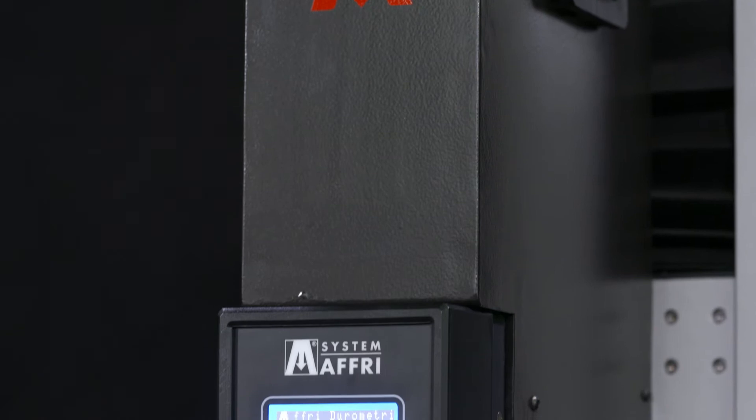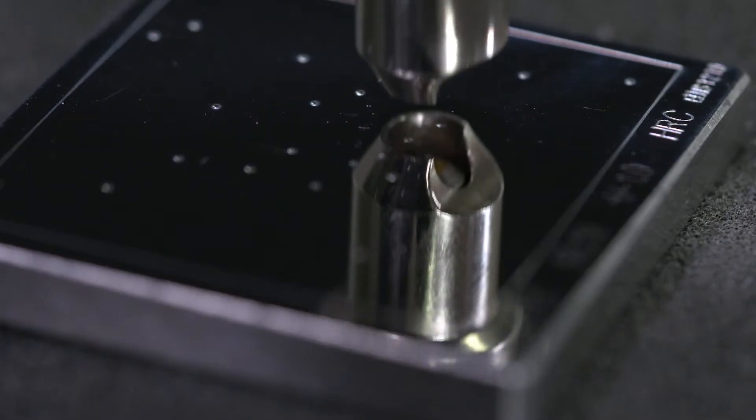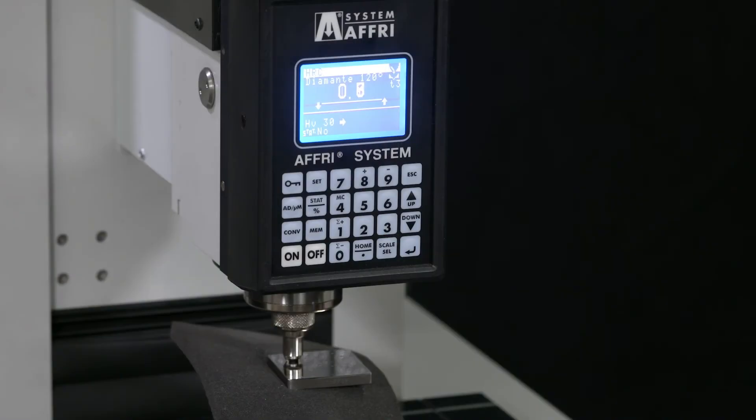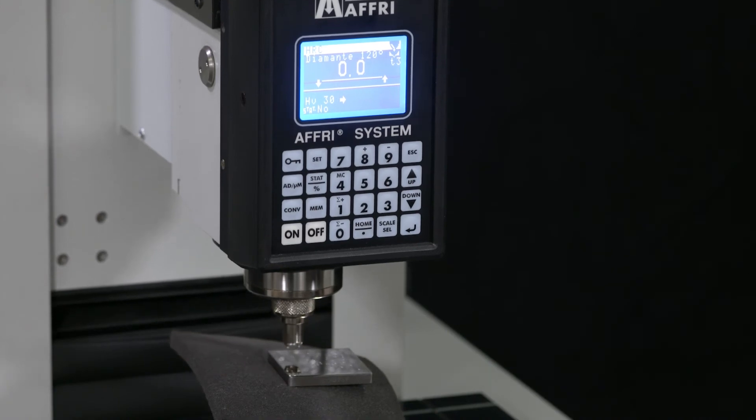In the event of structural failure or bending, the measuring head follows the surface of the piece while maintaining the test force.